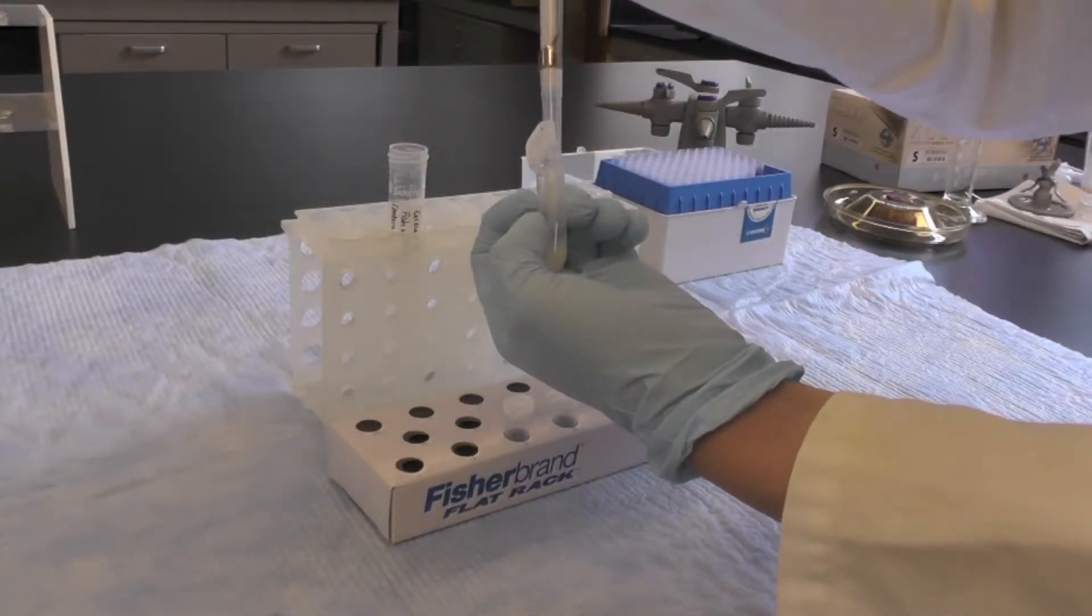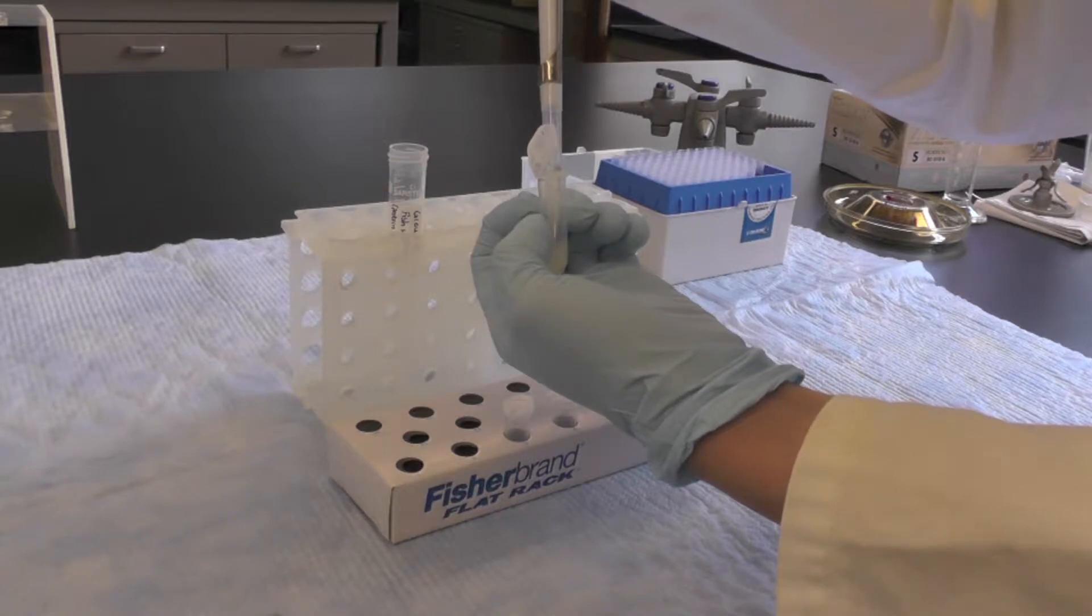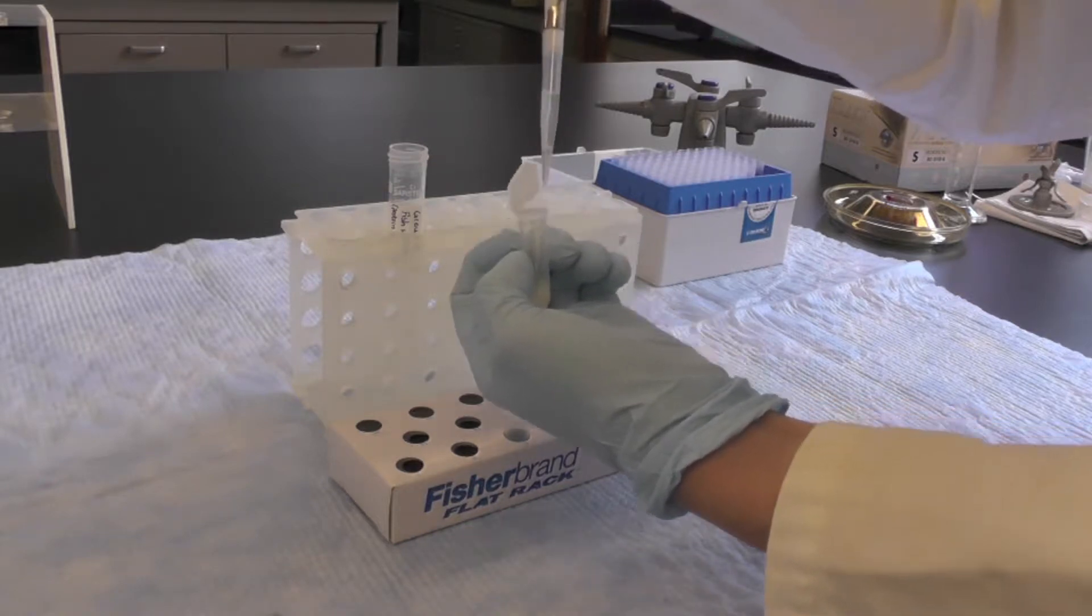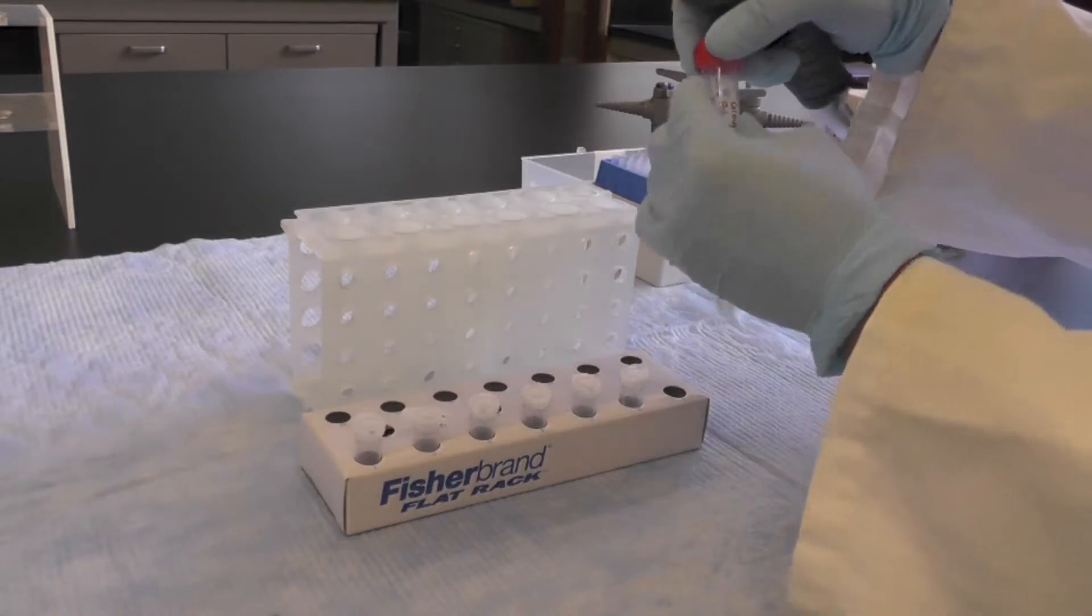Using a pipetment P1000 set to 1000 µL, collect the supernatant from all 6 microfuge tubes into a 15 mL falcon tube.